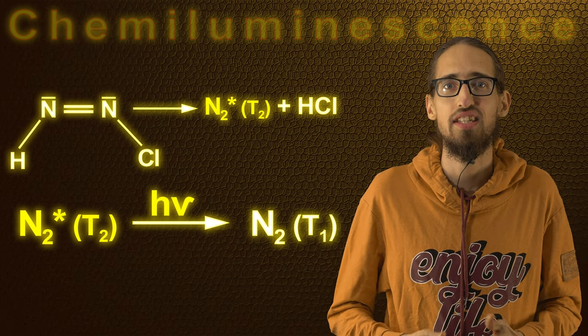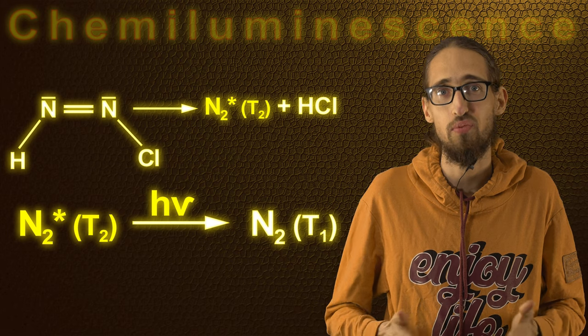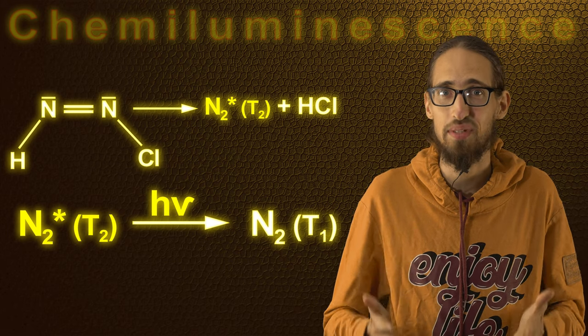This chemiluminescence is much brighter than the one from the previous video, and it can even be seen in the light.